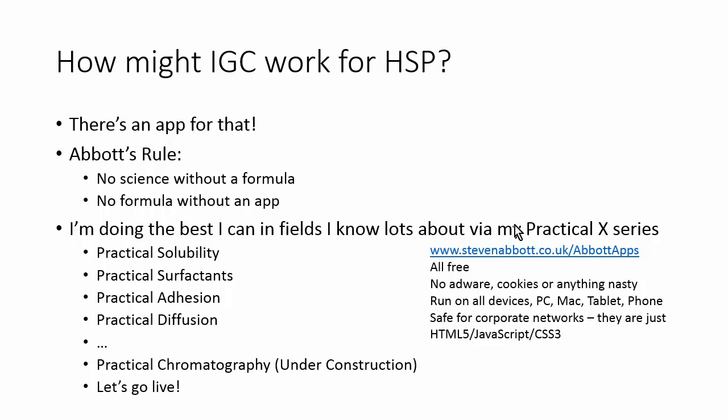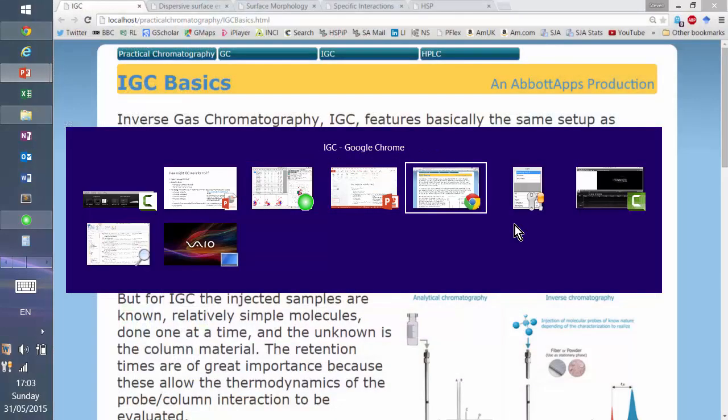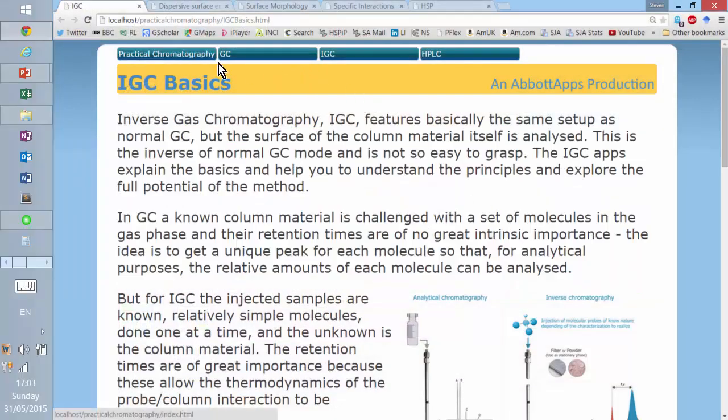Now I've started to construct Practical Chromatography with considerable help from AdScientist and Inolytix, which I most gratefully acknowledge. So let's go live to these. And here's Practical Chromatography, and I'm on the IGC basics. There's very little else in here at the moment. And here's a typical page, so it's an ordinary web page.